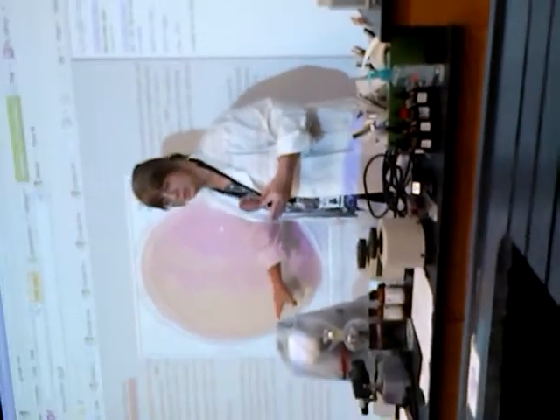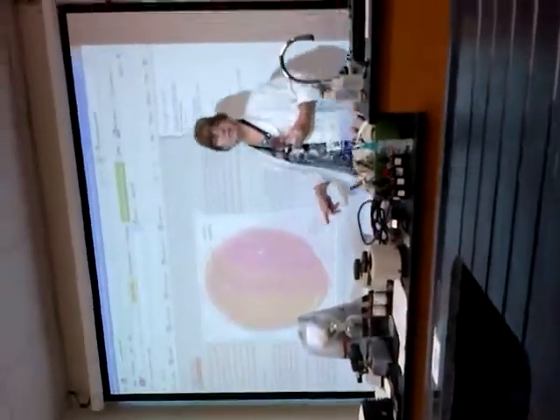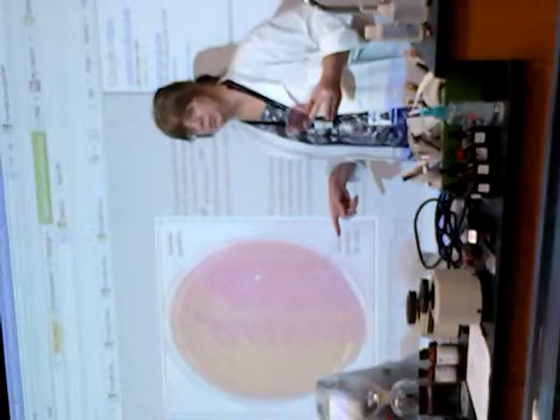Lactose fermentation. Which two of these could be coliforms? These two could be coliforms. Yellow, by definition, cannot be a coliform. And remember that metallic green sheen on the EMB.